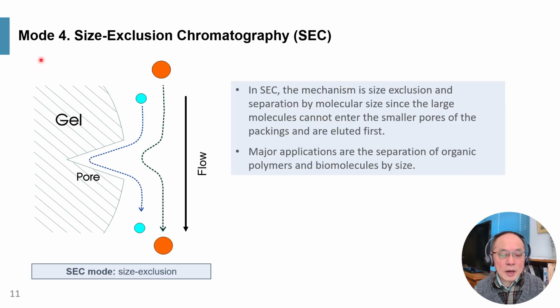Here we come to mode number 4, which is size-exclusion chromatography, or SEC. Shown here on the left-hand side is a particle of controlled pore support material.